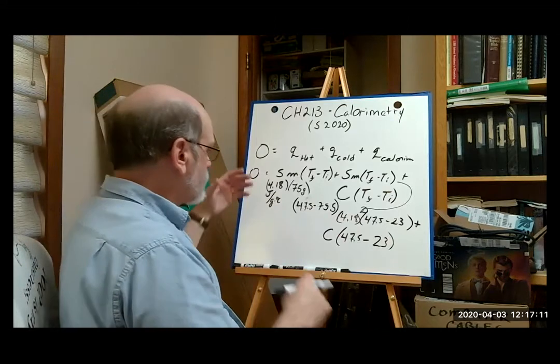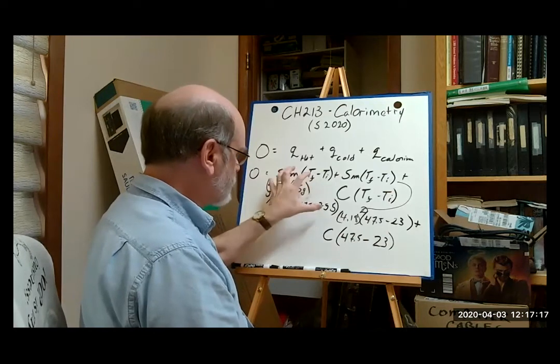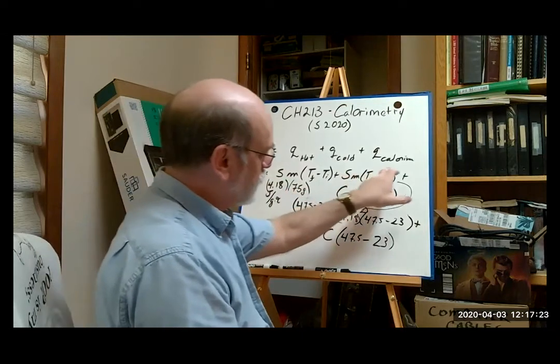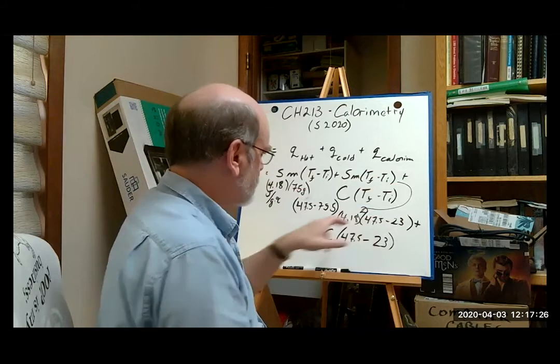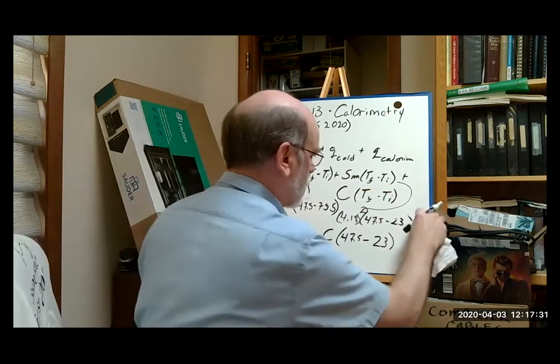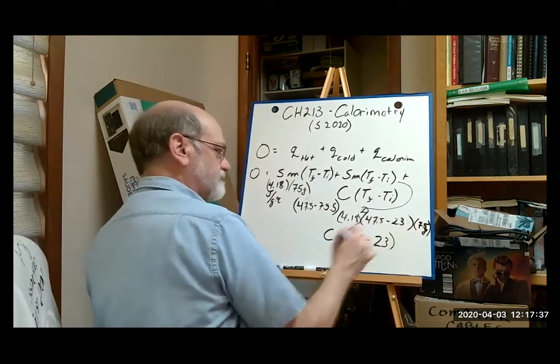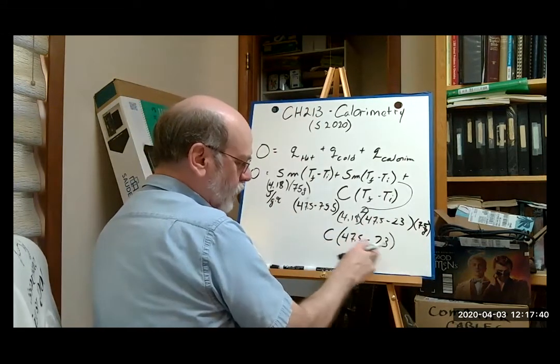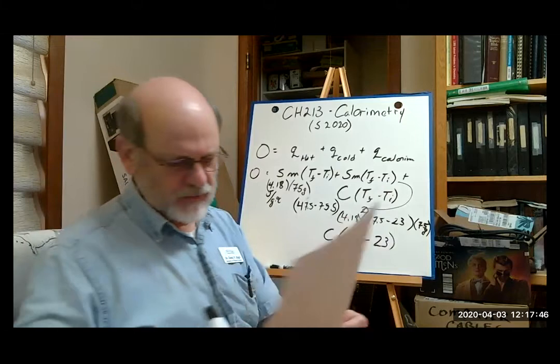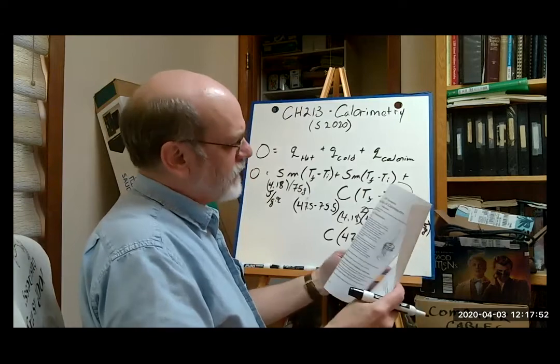So then all you have to do is resolve this amount right here. So subtract that one, multiply times that, and then this one, that, multiplied times that. We left out the mass of the water, times the mass. And then this one is whatever that difference is. And I give you an example of calculations here.